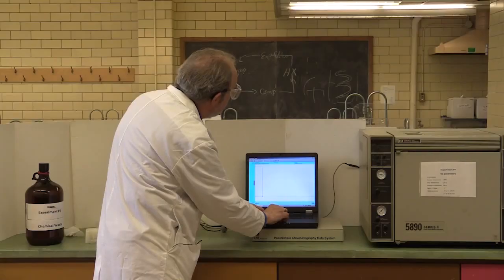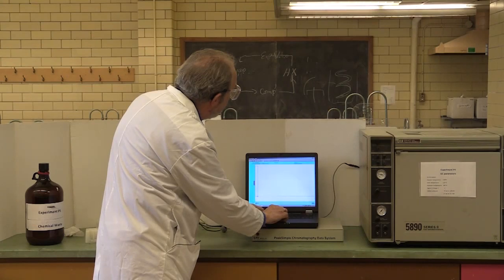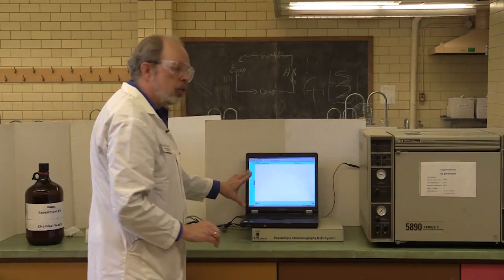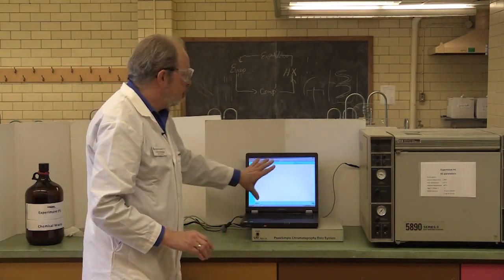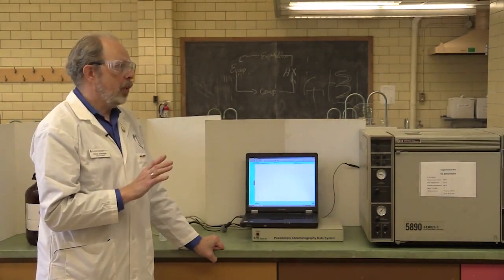You only want to take the first three minutes. What I've got there is too wide. It's eight minutes. So, I'm going to shrink that down to three minutes. And then you release the cursor and the full screen is now three minutes and you'll have a much easier to read screen.